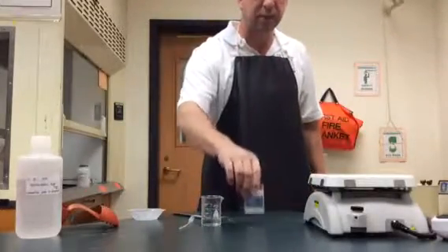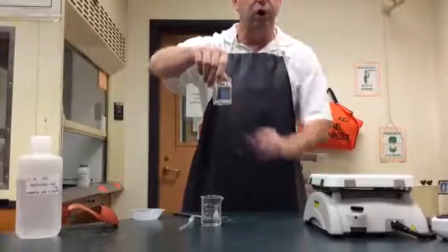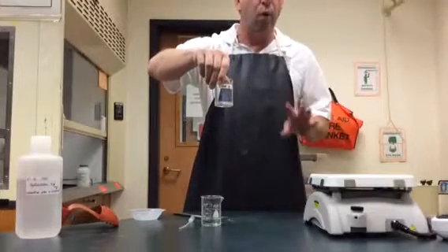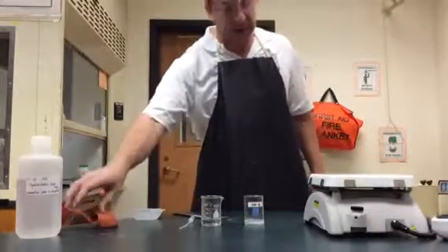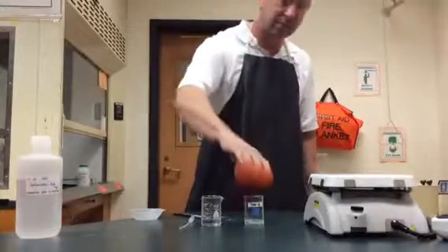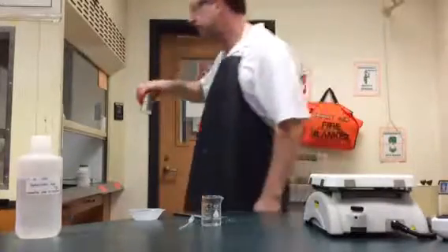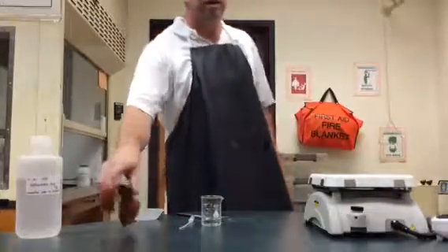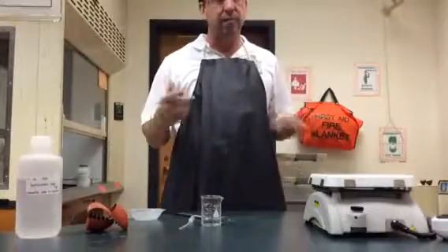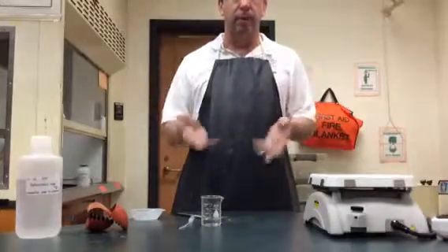Once the magnesium has completely reacted with the hydrochloric acid and there's no visible magnesium left — or almost none — I'm going to go ahead and bring it over into the fume hood, put it on the fume hood for a day, maybe two days, and wait for all of the excess water to be boiled off.